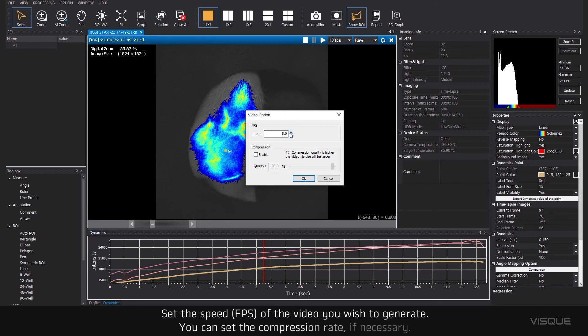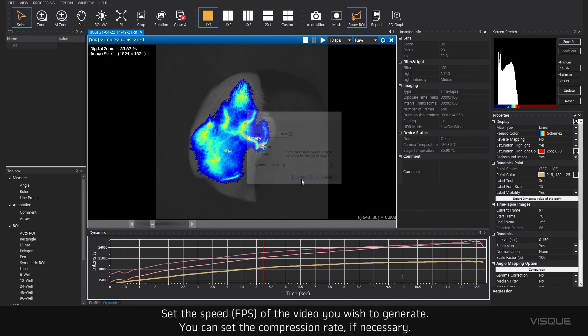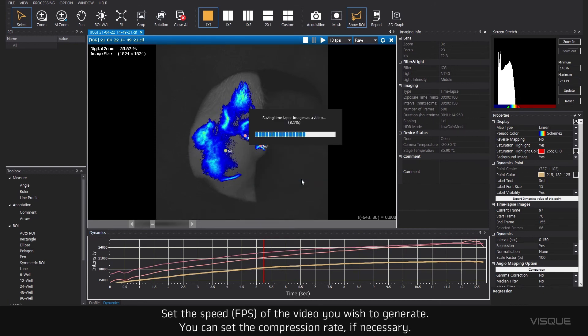Set the speed of the video you wish to generate. You can set the compression rate if necessary.